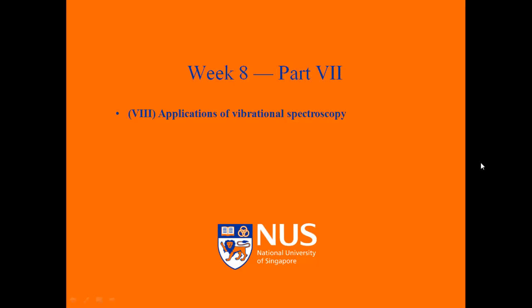Welcome to the final part of this week's online lecture. In part 7, we will briefly discuss applications of infrared spectroscopy.